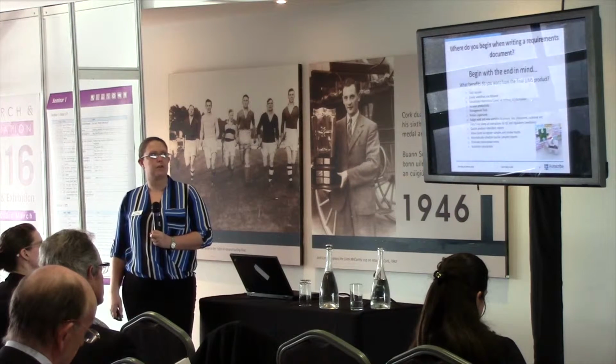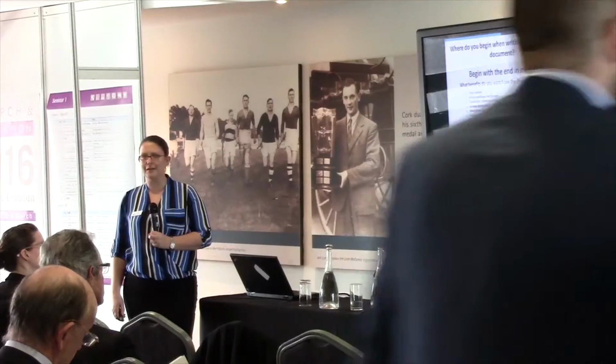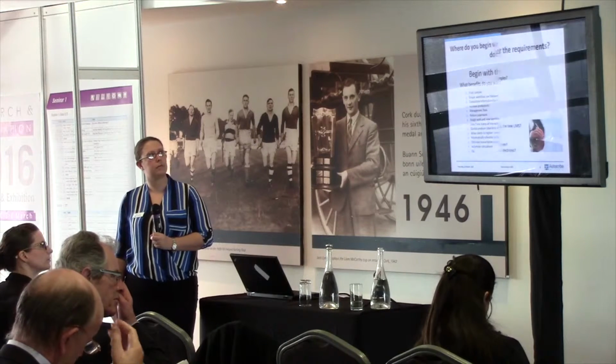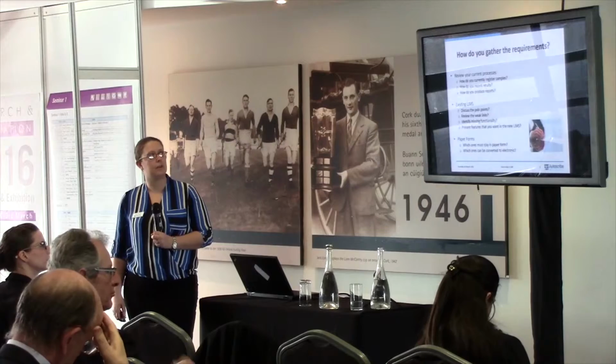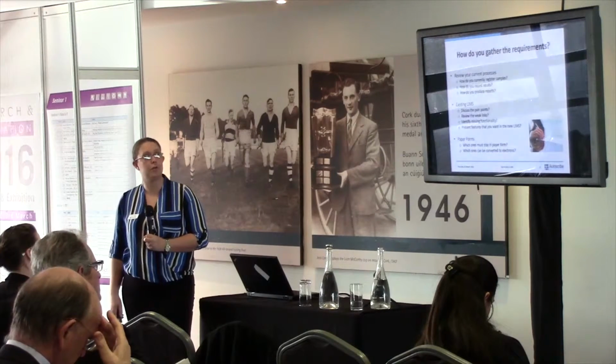And finally, you've got automatic calculations. Would you like a system to be able to do all of the background calculations for you? So how do you gather requirements? Looking at current processes. What do you want to improve? But start with what you've got.